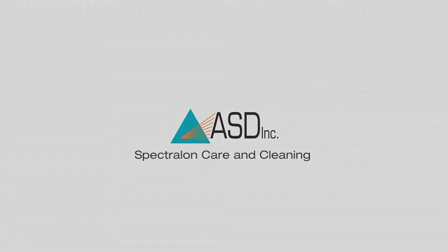Spectralon Care and Cleaning. Hi, my name is Michaela Kastenek and I work at ASD. Today I'll be showing you how to clean and care for your Spectralon panel.